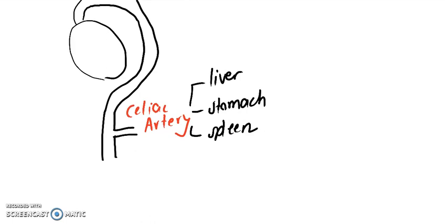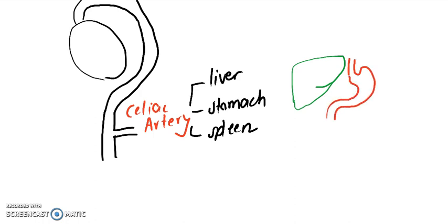Okay, so let me see where this fits in. So here is your liver, your stomach. Try to put everything into context, and then the spleen is this very flattened out structure near your stomach.